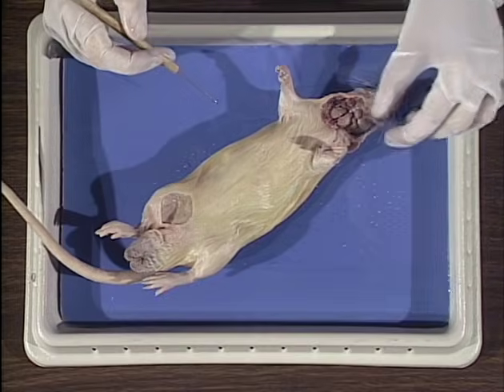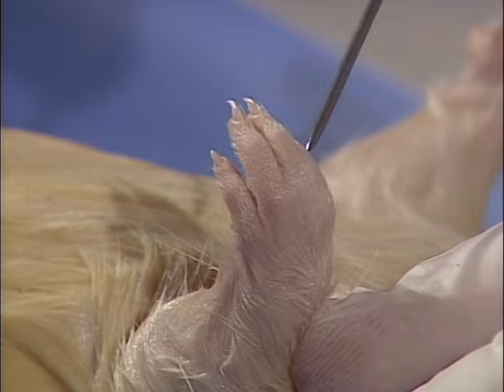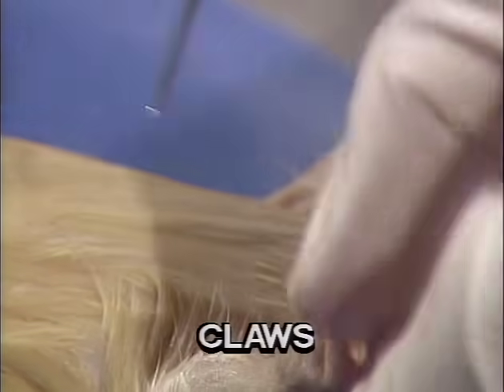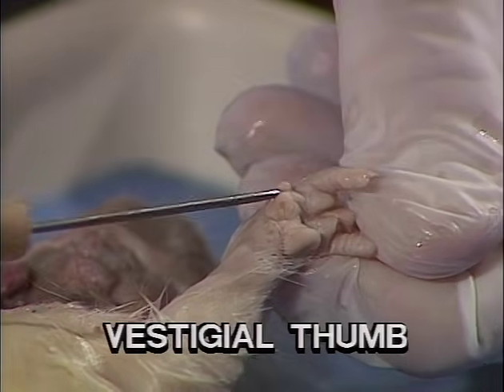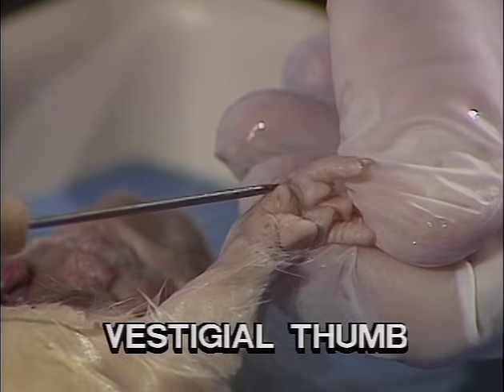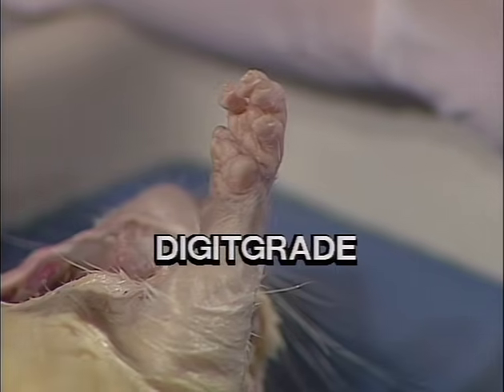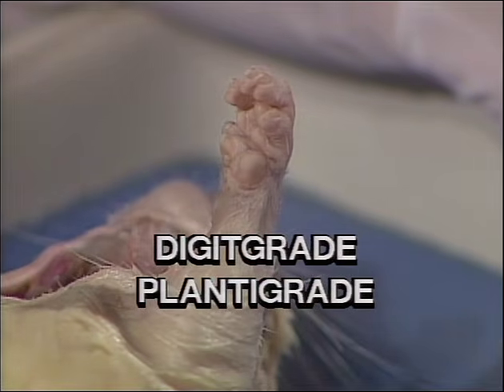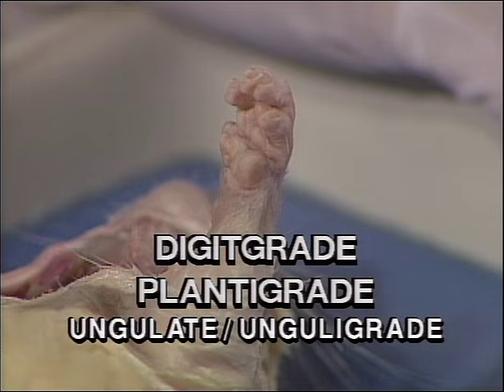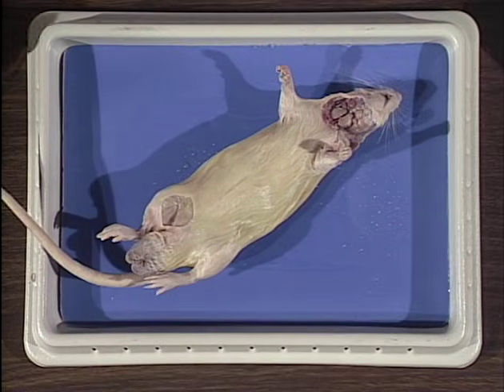We will now look at the feet of the rat. On the feet we see two specialized derivatives of the skin. We see the claws and the foot pads. This is the vestigial thumb. Rats walk on their toes with their soles elevated. This is called digitigrade locomotion. Humans walk on their entire foot, and this is called plantigrade locomotion. In horses and cattle, this is modified into a hoof, and they are known as ungulates. This concludes the external anatomy.